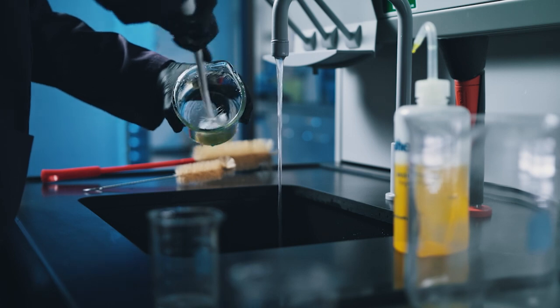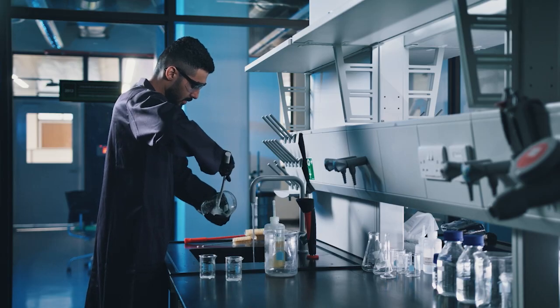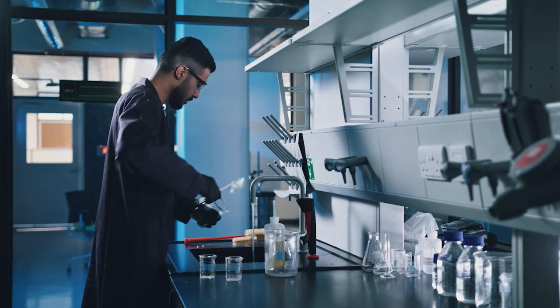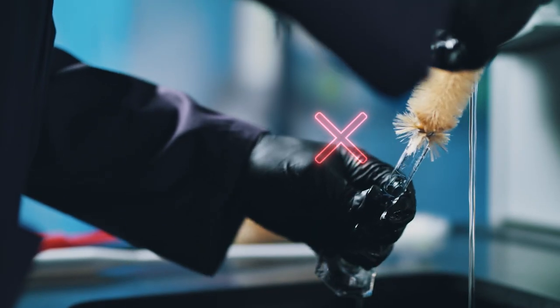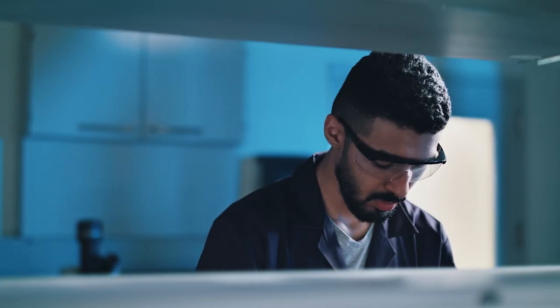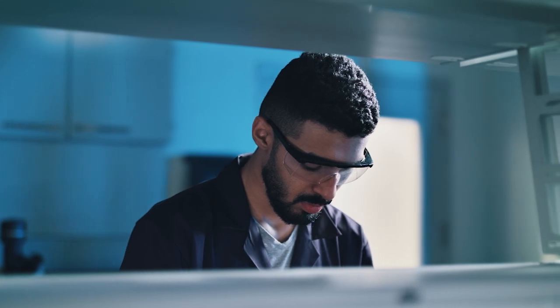Clean your dirty glassware at the laboratory sink using hot water, environmentally acceptable cleaning agents, and brushes of suitable stiffness and sizes. Do not force a brush into glassware. Always wear goggles while washing glassware, and wear gloves if instructed to do so.